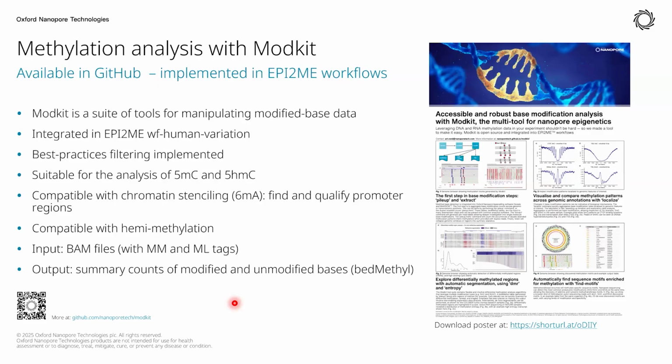So if you do have multiple samples and you want to see how the methylation patterns are different between them, you can always run that data through this software. And before we move on, I just wanted to say that we do mention methylation nonstop in ModKit because it was initially designed for looking at 5mC, 5hmC modifications.